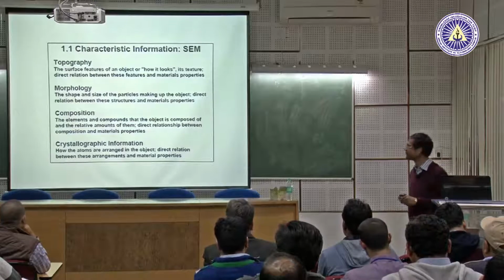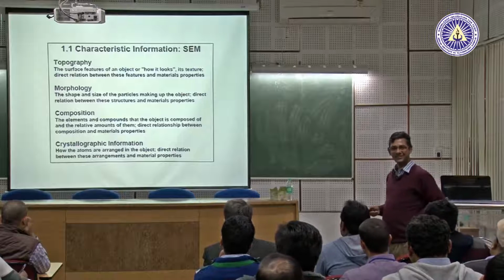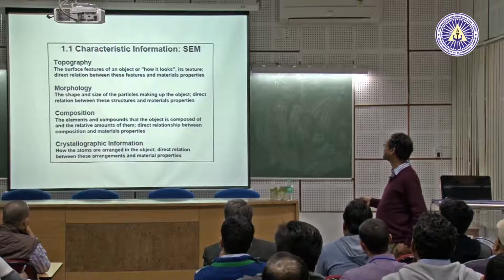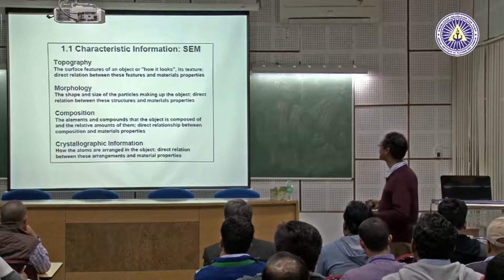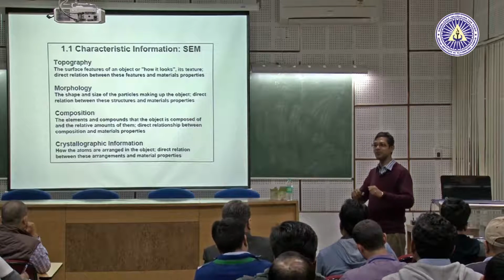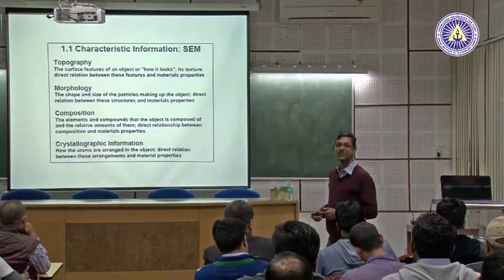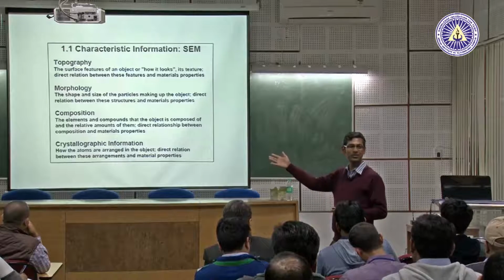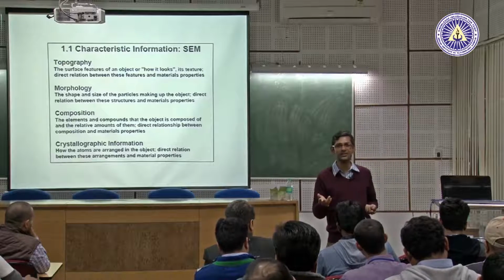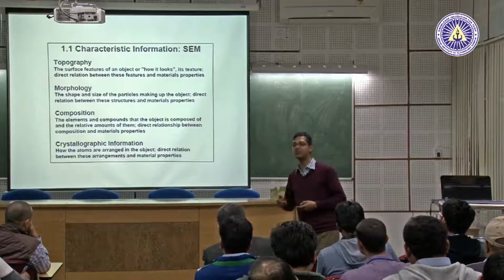Okay, so what all do you do in a nutshell in SEM? You do all this stuff nowadays, but these are not all. Many other things you can do also. First, the most routine thing you do is topography. How does the surface look like? Those of you who have broken samples, fractured and seen them under the SEM, this is what you should look at, right? How the surface looks, whether there is a brittle fracture, ductile fracture, mixed mode fracture, intergranular fracture, or intragranular fracture, all these things can be obtained from this.